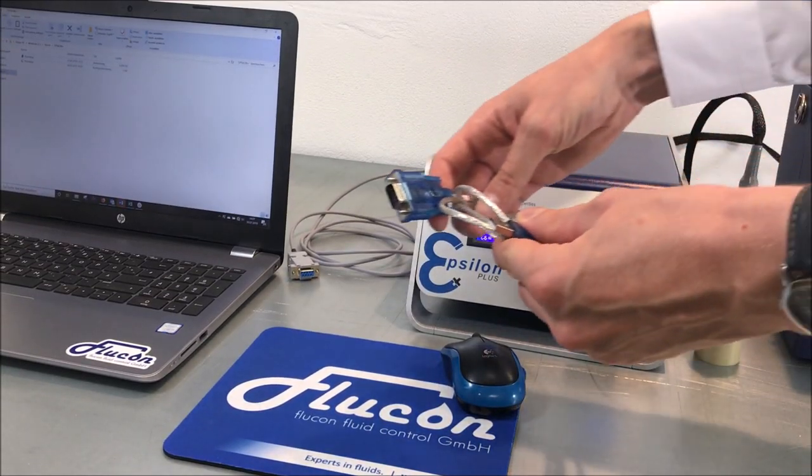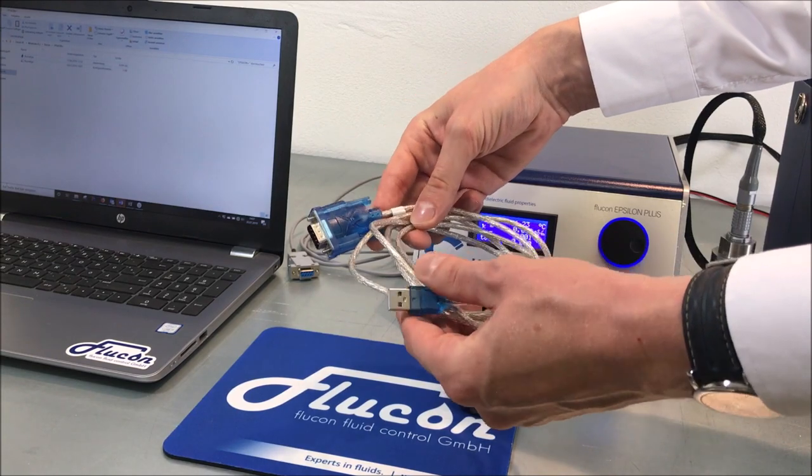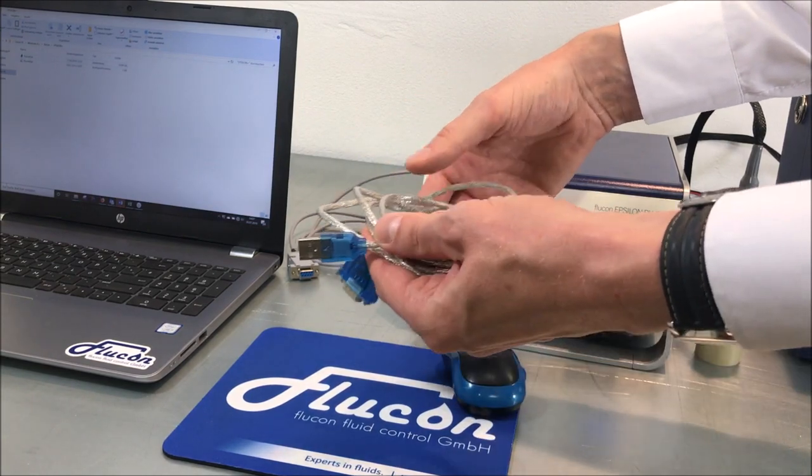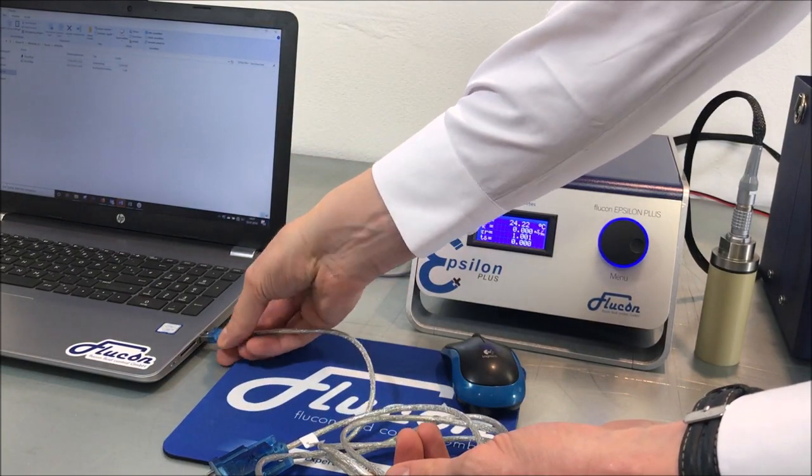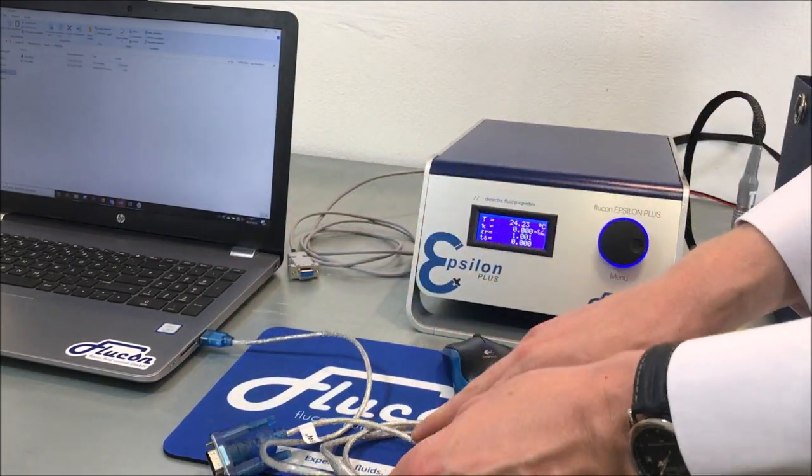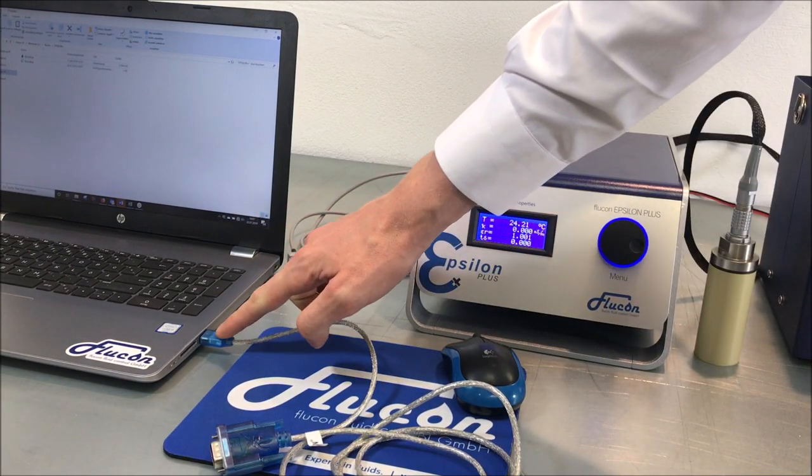If there is no serial port available on your computer or laptop, you may want to use the serial to USB connector for adaptation. Make sure that you plug it into the USB port of your computer first. Its driver must be installed correctly before connecting the Epsilon Plus.